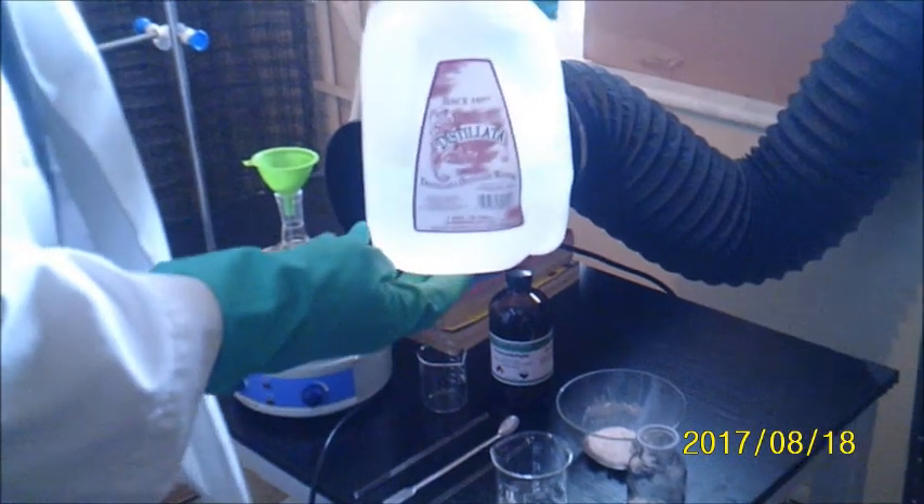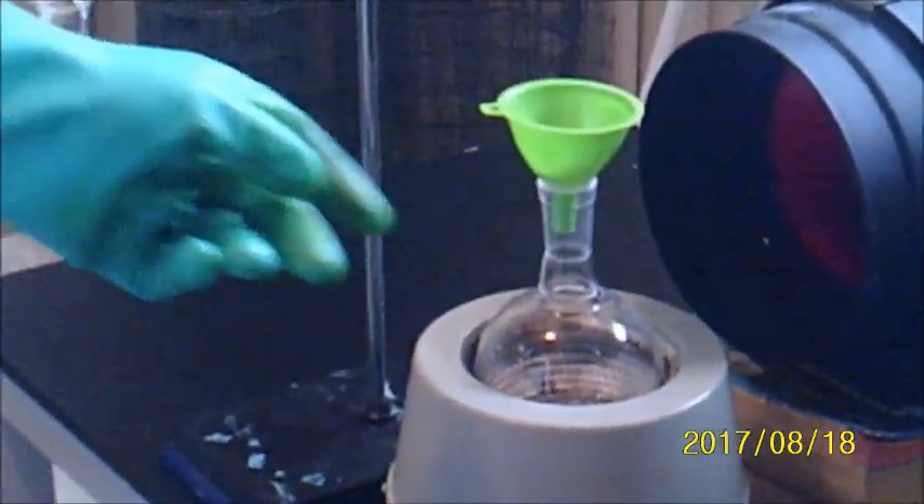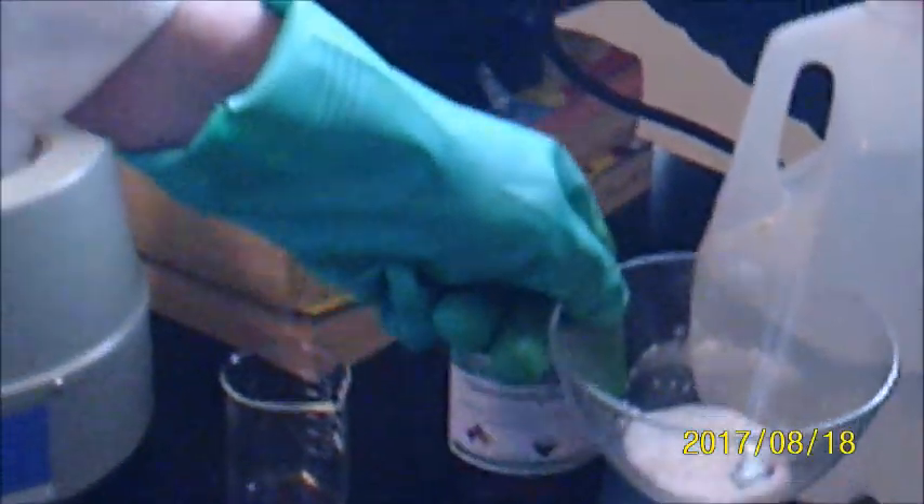Let's run through the ingredients. We have distilled water, a round bottom flask, and a distillation column to cap the round bottom flask. We have a 37.6% formaldehyde solution, 150 milliliters of distilled water, 7.5 grams of sodium carbonate, 2.5 grams of magnesium hydroxide, and also 2.5 grams of calcium hydroxide, not pictured here.